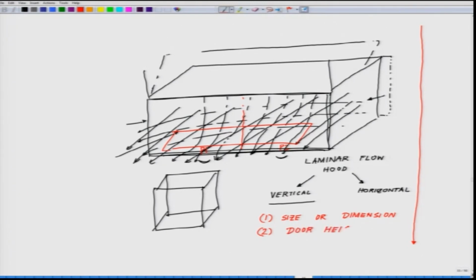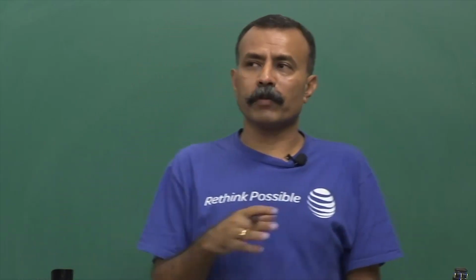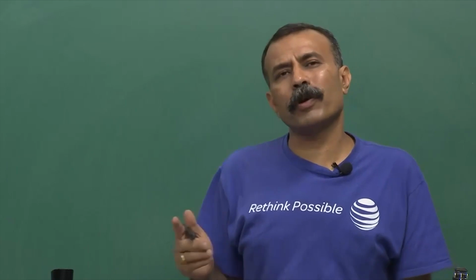However trivial it may sound, you have to get this laminar flow hood inside the room, so you have to ensure that it can be done. Do not just rely on the manufacturer taking care of it. Of course, the manufacturer will take care of it, but there are repairing issues, and it may have to be taken out. There are so many problems which come through it.